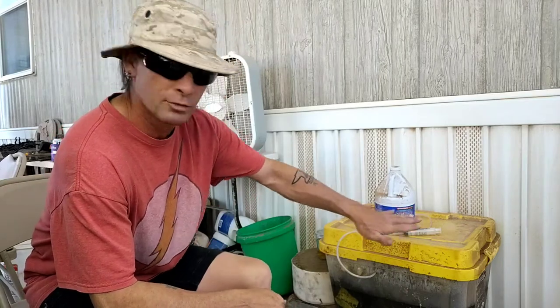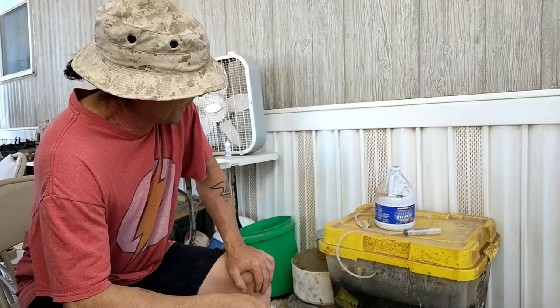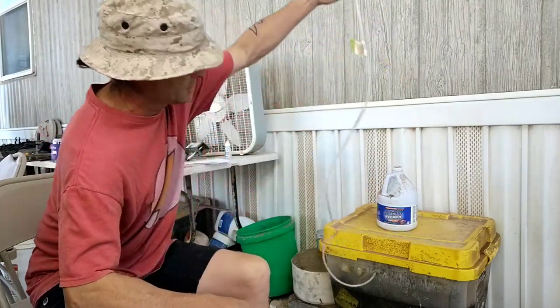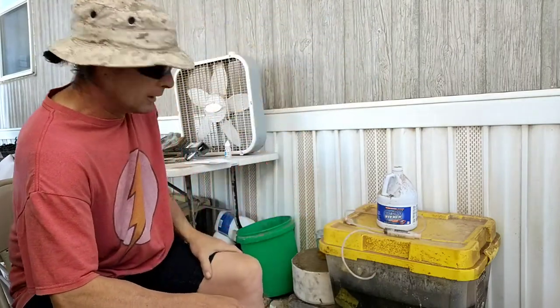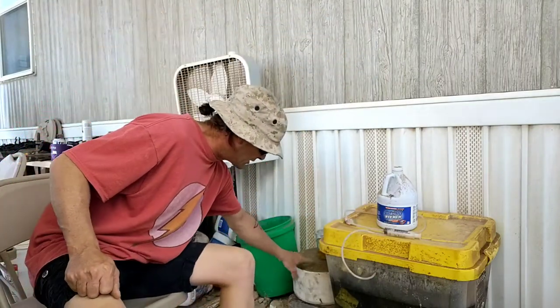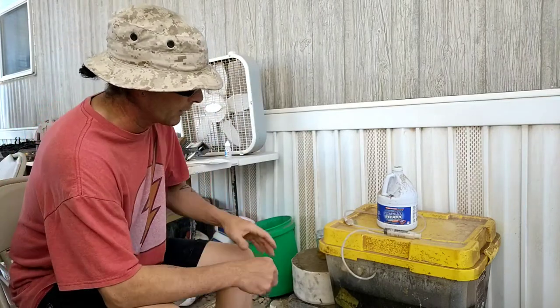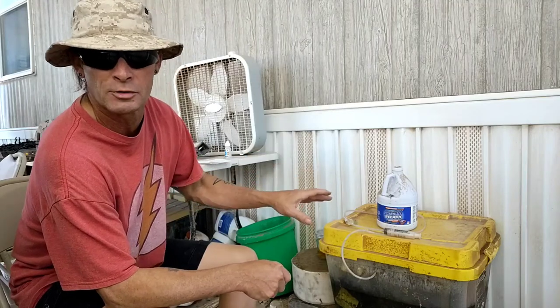If you notice right here, I've got this tote that's kind of partially full of some green liquid. I've got a can of bleach hanging out on top of it, a little syringe with a tube going down into the tote. Right beside it I've got a piece of ceramic substrate out of a DPF filter. What I've got going on here is I'm leaching the platinum group metals out of the ceramic substrate using hydrochloric acid and bleach.